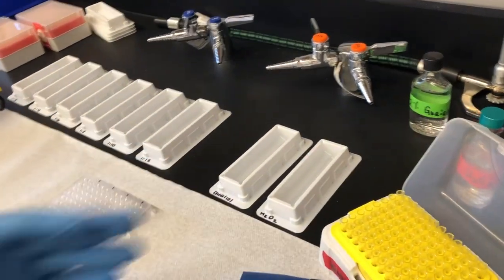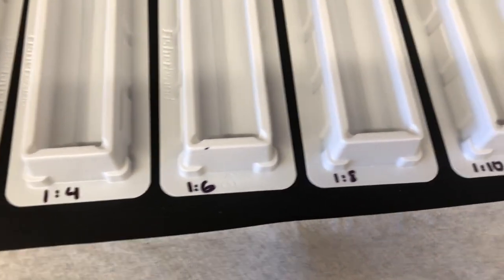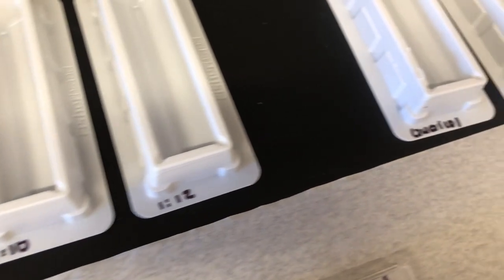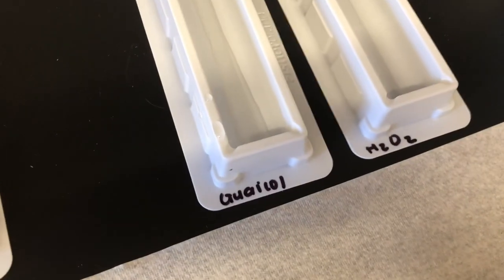Before we begin, you want to label troughs with different dilutions and all the other controls.